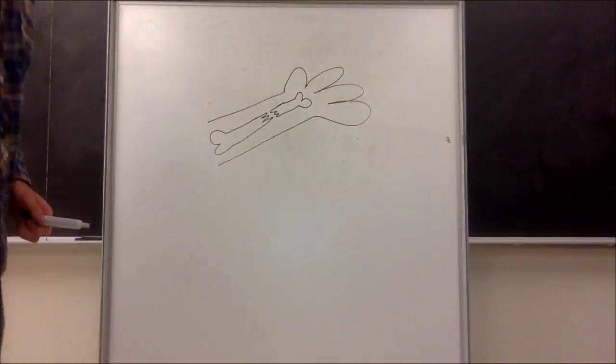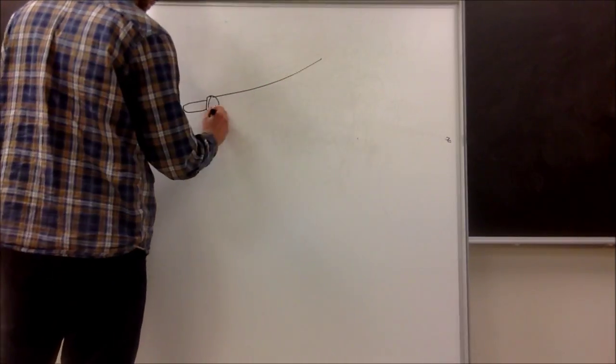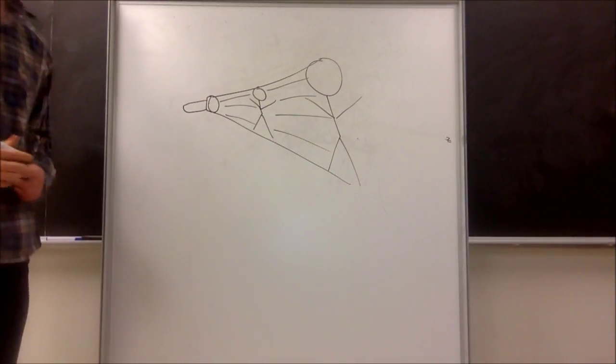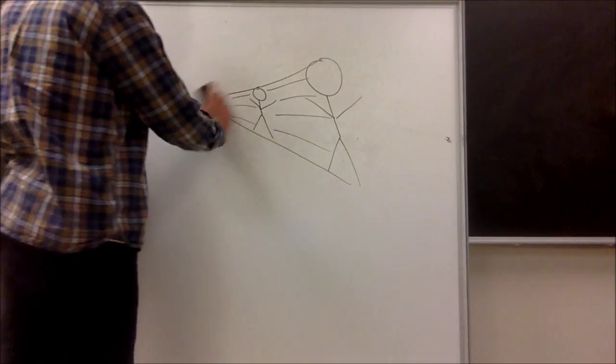Have you ever wondered how doctors are able to see what your bones look like after you break your arm? In the late 1950s, an American inventor named Sterling Newberry placed a specimen between an X-ray source and a target plate, giving birth to commercial X-ray imaging. When used on small objects, this is known as X-ray microscopy.